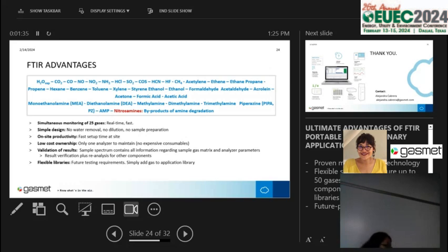The same instrument that is going to do ambient at 600, 700 parts per million, although at such high concentrations, it's best to get a separate one with a shorter path length. But yes, it's possible. So now that's parts per million. Essentially, we're talking percent, so 10,000 parts per million.